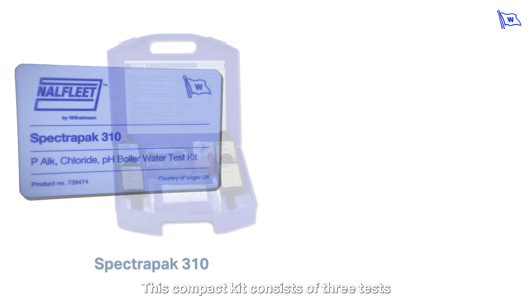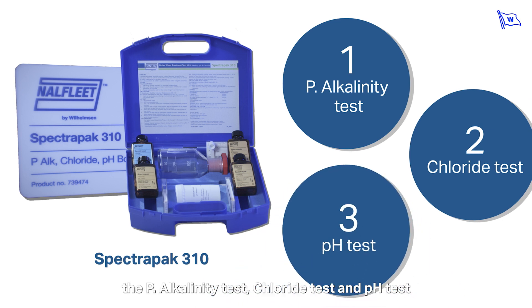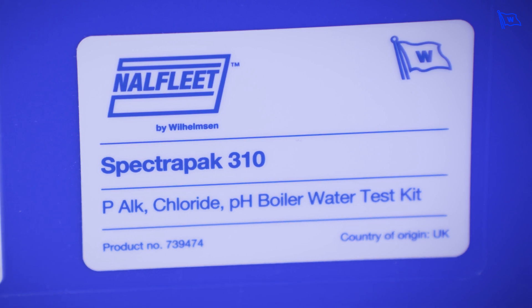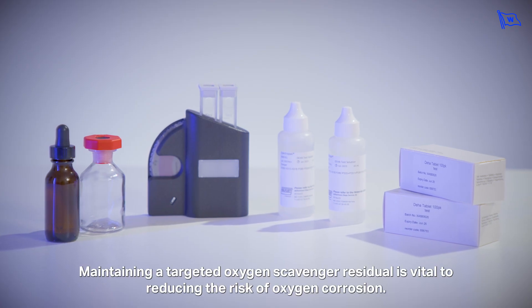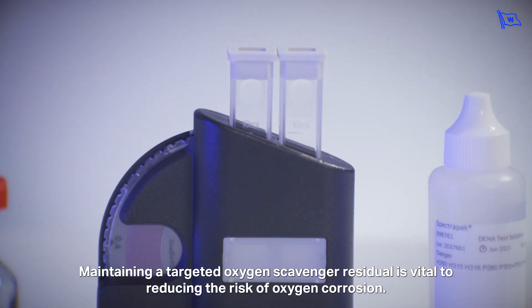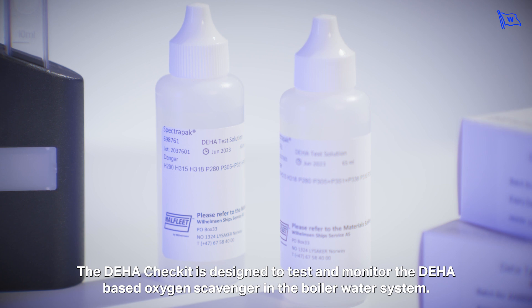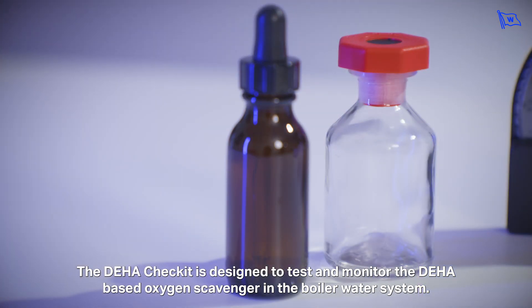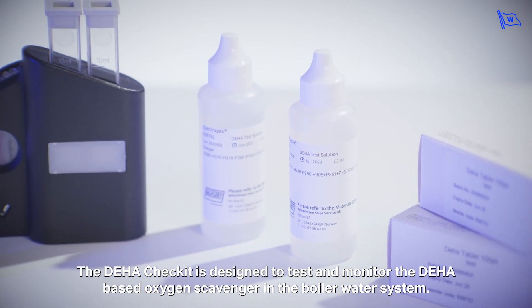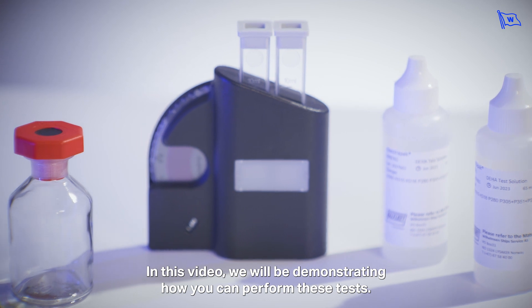This compact kit consists of three tests: the P-alkalinity test, chloride test, and pH test. Maintaining a targeted oxygen scavenger residual is vital to reducing the risk of oxygen corrosion. The DEHA Check-It is designed to test and monitor the DEHA-based oxygen scavenger in the boiler water system. In this video we'll be demonstrating how you can perform these tests.